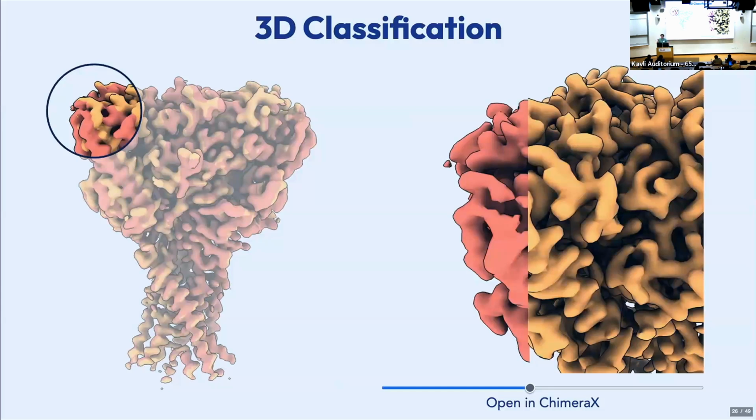So now what you can do if you want is go back through and say, okay, take all the particles that have no ligand bound, that never went into the yes ligand class, put all those in a group, and then unsymmetry expand them, right? Just take one of those images. Then you can do the same thing with the particles that were only in the ligand group once. The same thing with the ligand particles that were only in the ligand group twice, etc. So now you've gone back down to single images because you're throwing away the multiples of all these images. But now you have a single copy of particles that you think only have 0, 1, 2, or 3 copies of ligand bound to that particle.